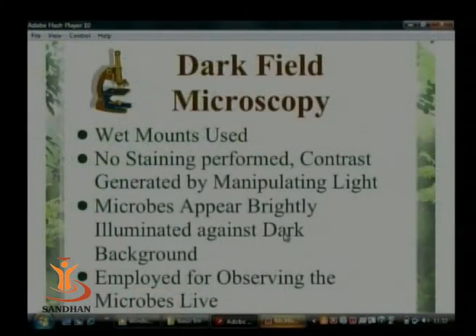And the microorganisms, if they are present in the field of observation, are capable of refracting a tiny amount of light which will enter the objective. We are going to observe that in the next slide. How exactly does this happen?